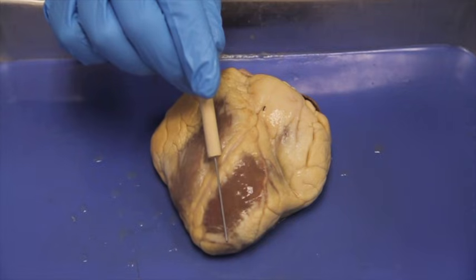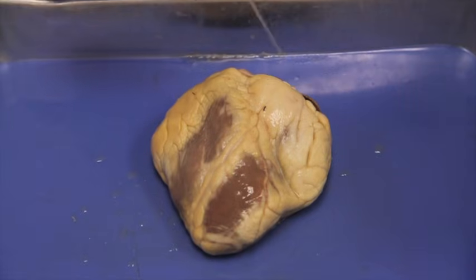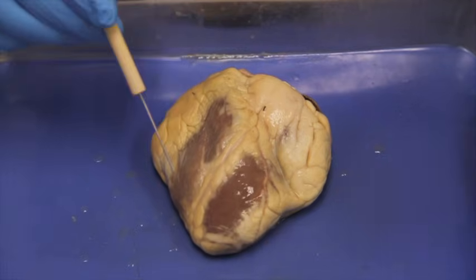The opposite side is called the base. This is where all the valves are located and all the vessels. So the larger side is the base, and the smaller side is the apex.